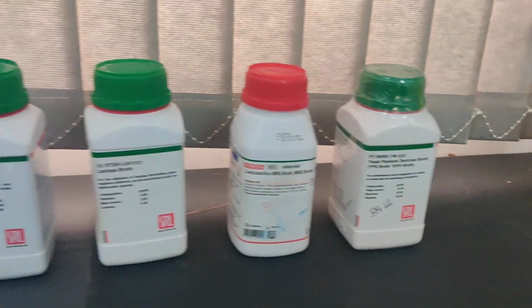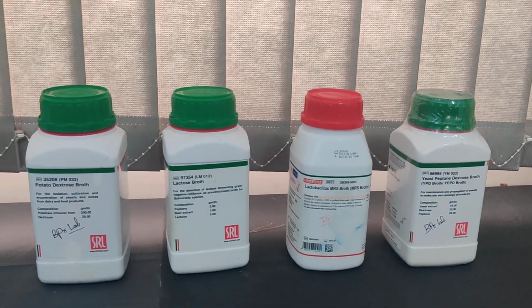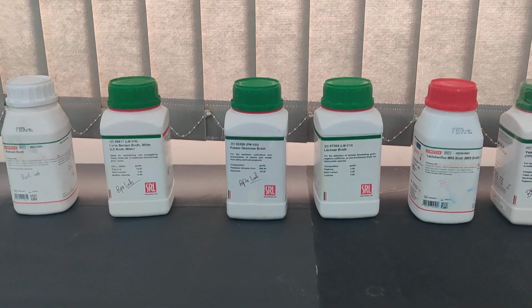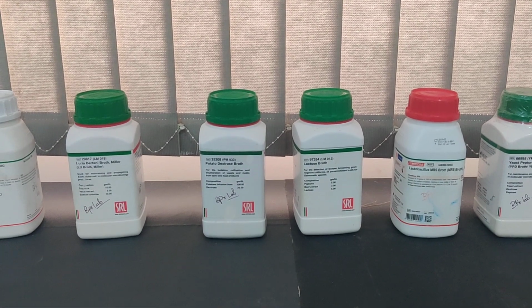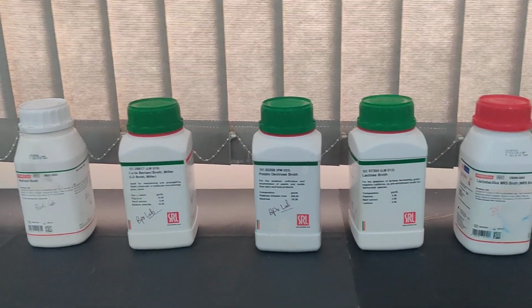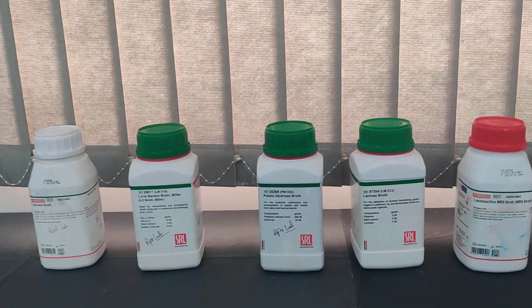So this is how all these nutrient mediums or nutrient broths differ. Either way, if you look, they would not have mentioned anything about the solidifying agent. Examples of solidifying agents are gelatin, agar, agarose. In none of the compositions was anything like agar or agarose mentioned, right? So you can very easily understand that this is not a solidifying medium. If you prepare a medium with these things, it will be only in liquid form. For that you have just to add water.